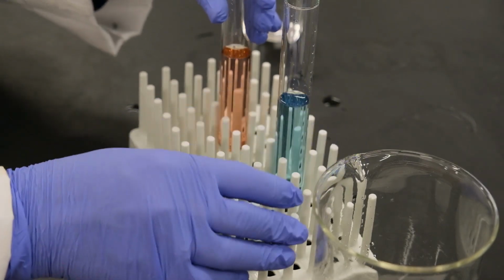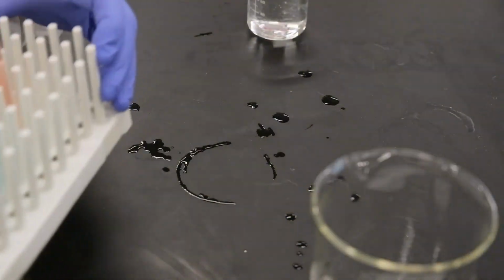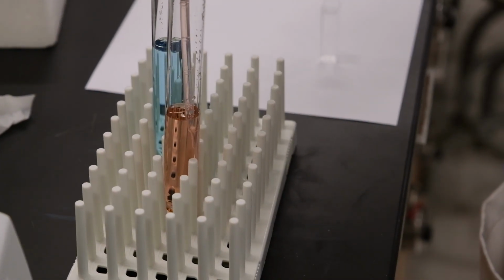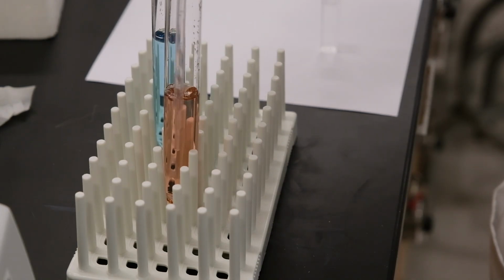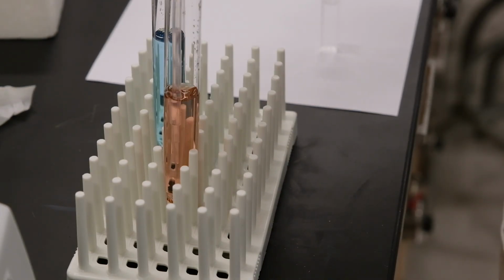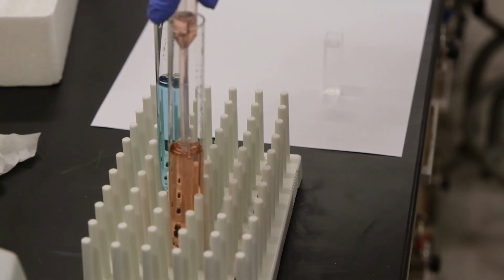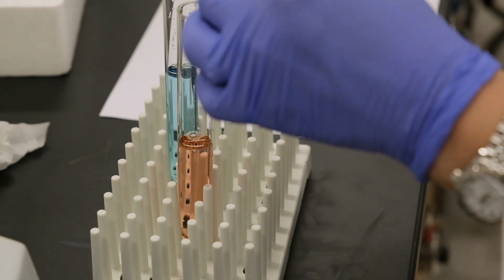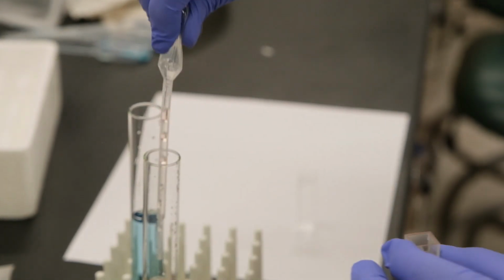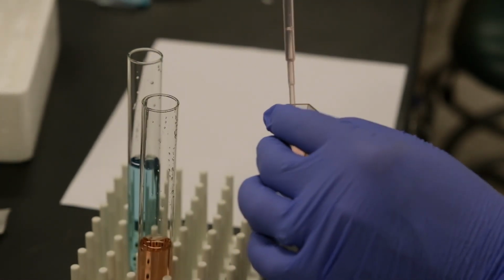So let's move to the spectrophotometer. We mix our solution because, do you remember, we added twice 10 milliliters. So we want to be sure that the concentration is the same throughout the test tube, and we place the Allura red in our cuvette.